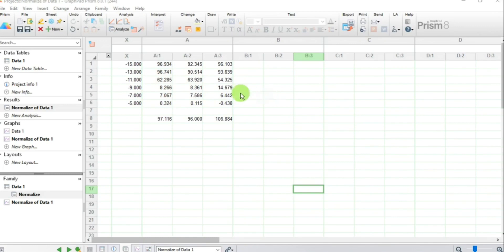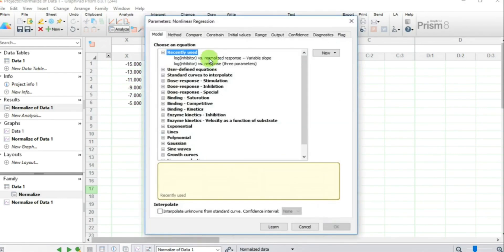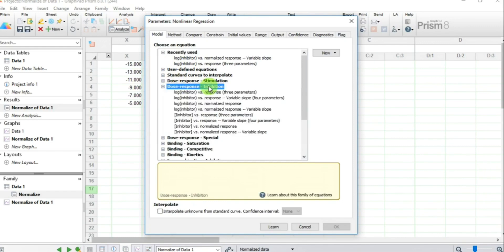To obtain the concentration-response curve, press Analyze, go to XY Analysis, and select Nonlinear Regression Curve Fit. Press OK. You will see a range of different choices, including Dose-Response Stimulation and Dose-Response Inhibition. Since our compound is an inhibitor, select that option.